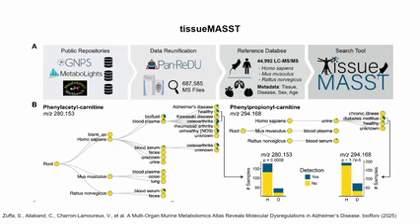So it's the same thing again. You have one specific USI, you just put it in tissue MASST. I don't provide the link here, but I can add it. And then it can show you, okay, it's found in specific diseases, it's found in urine samples of humans, it's associated with diabetes. So this is just a similar tool that you get to use here.